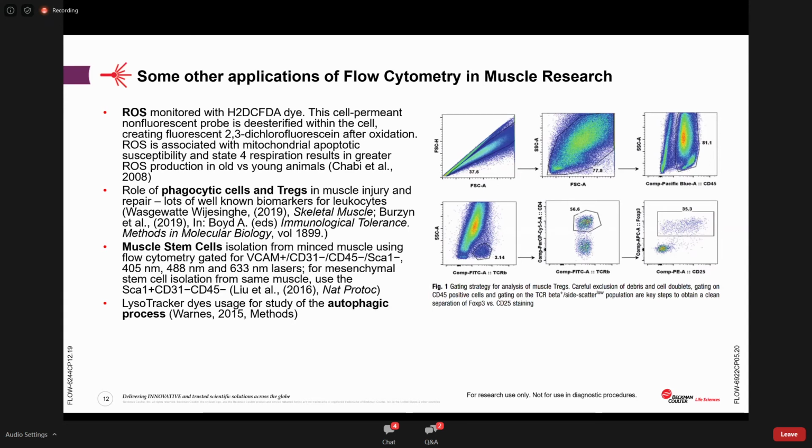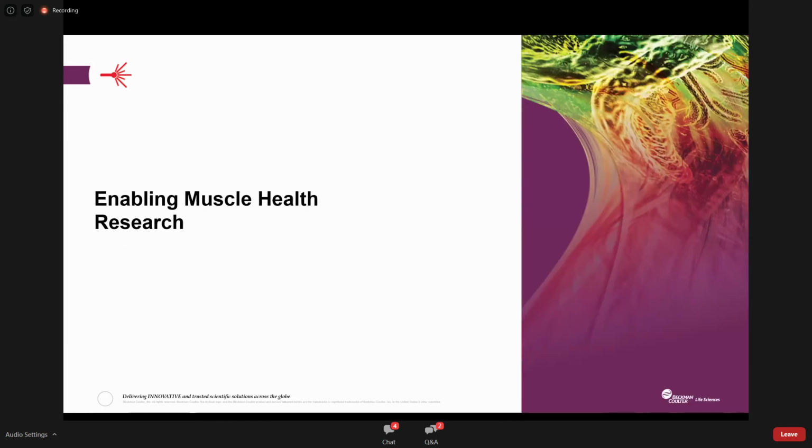In the span of time in which a patch clamp might answer one experimental question, flow cytometry would answer tens or hundreds. No offense to patch clamp physiologists present. I was one myself. One last thing.